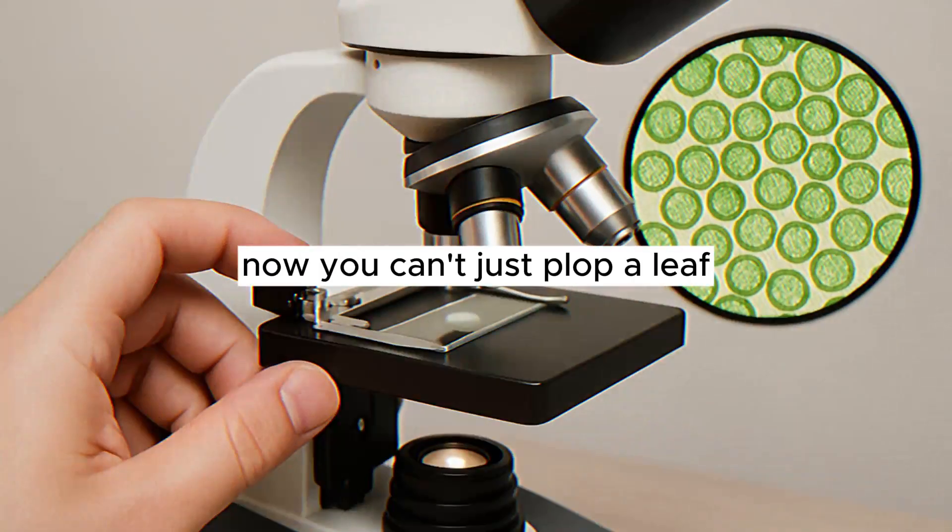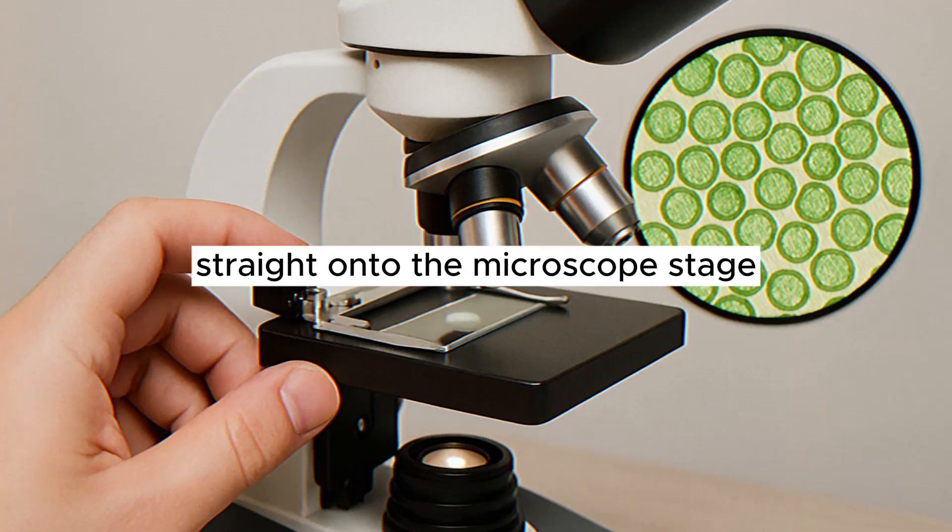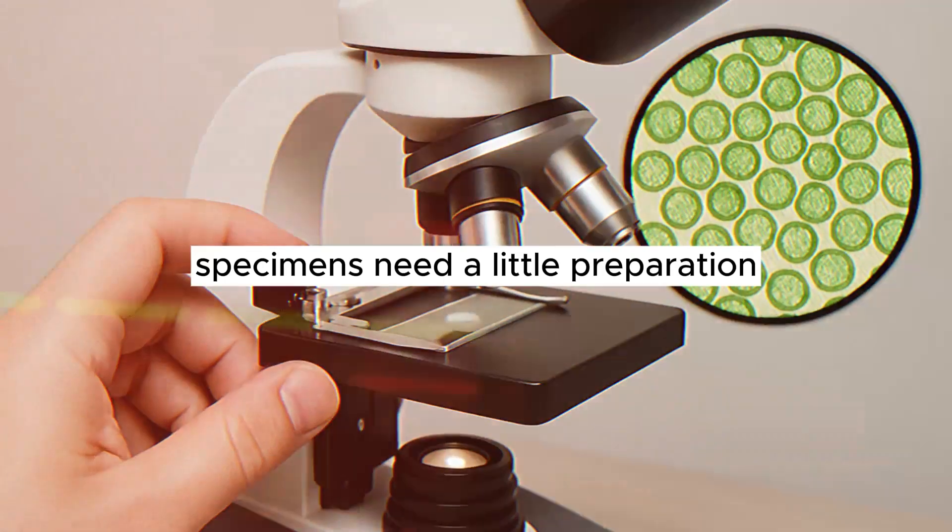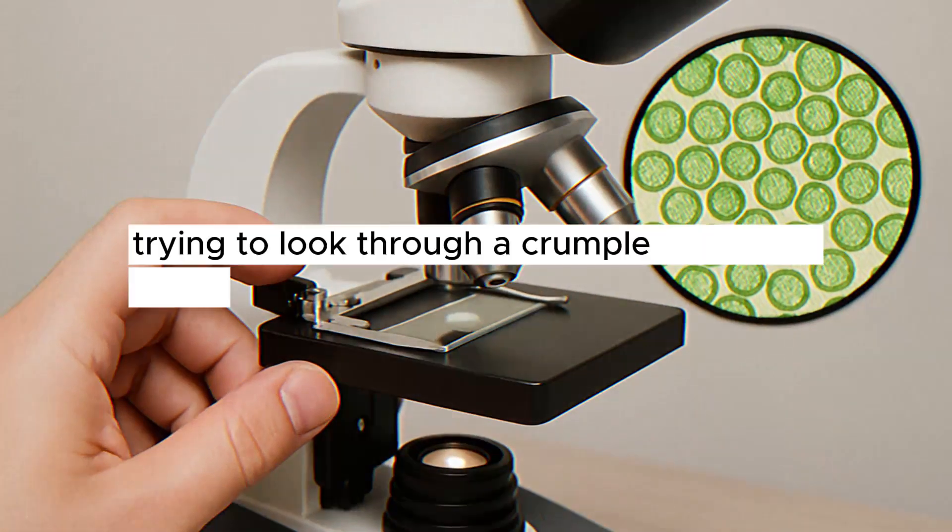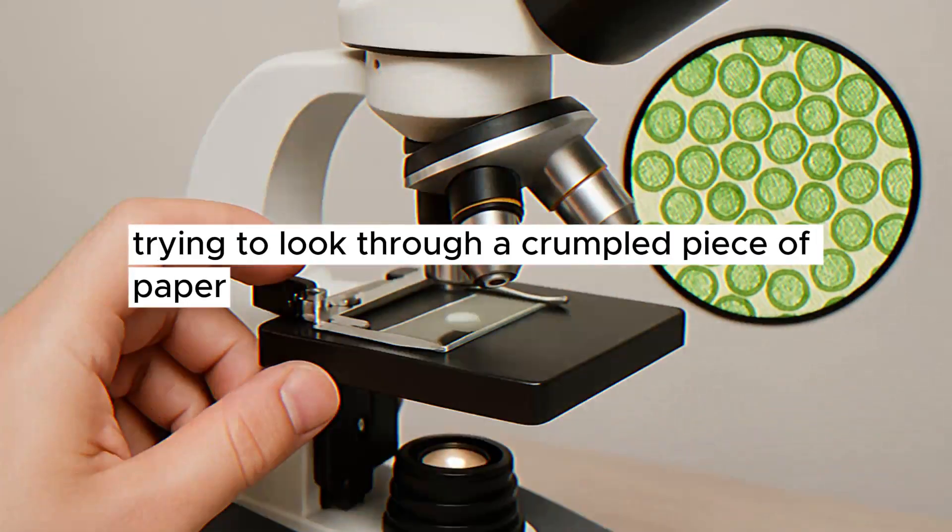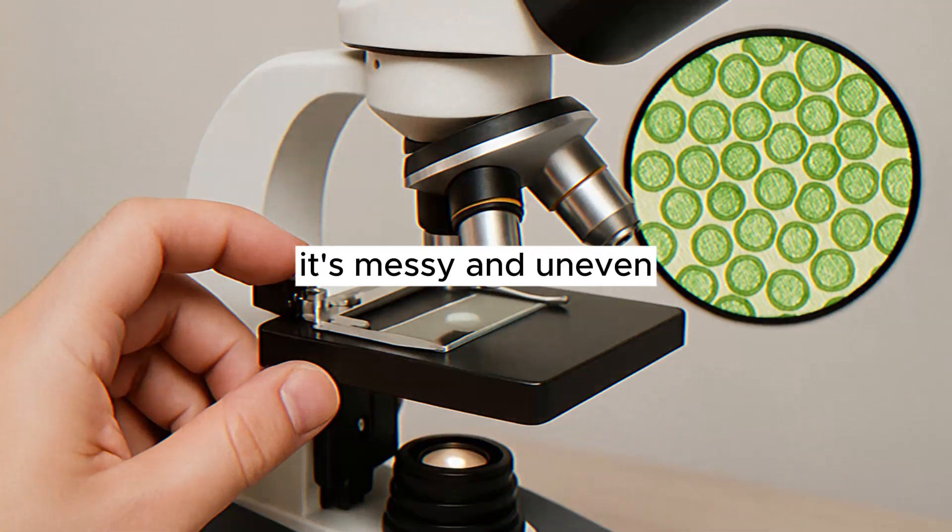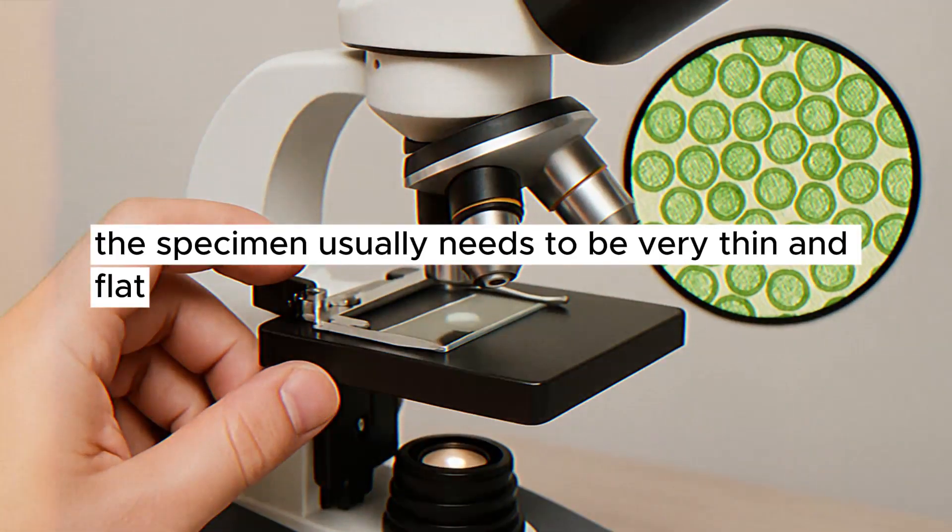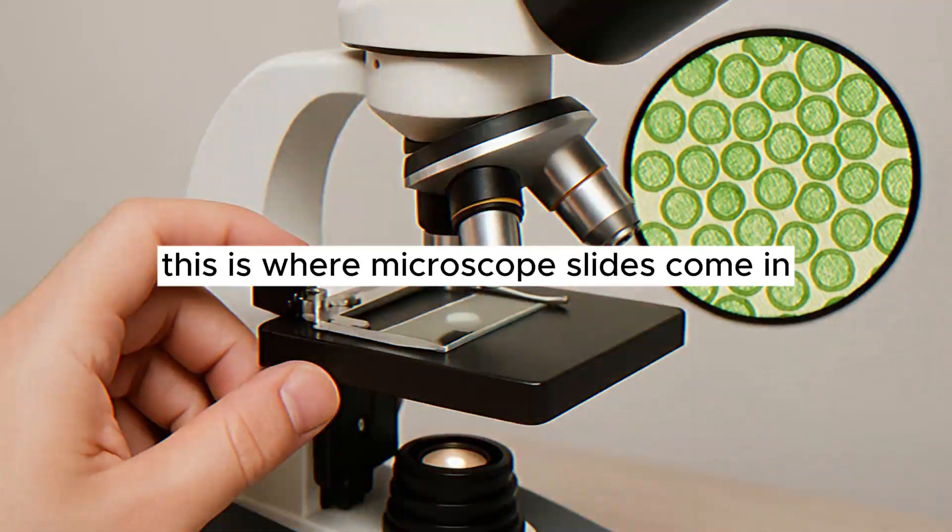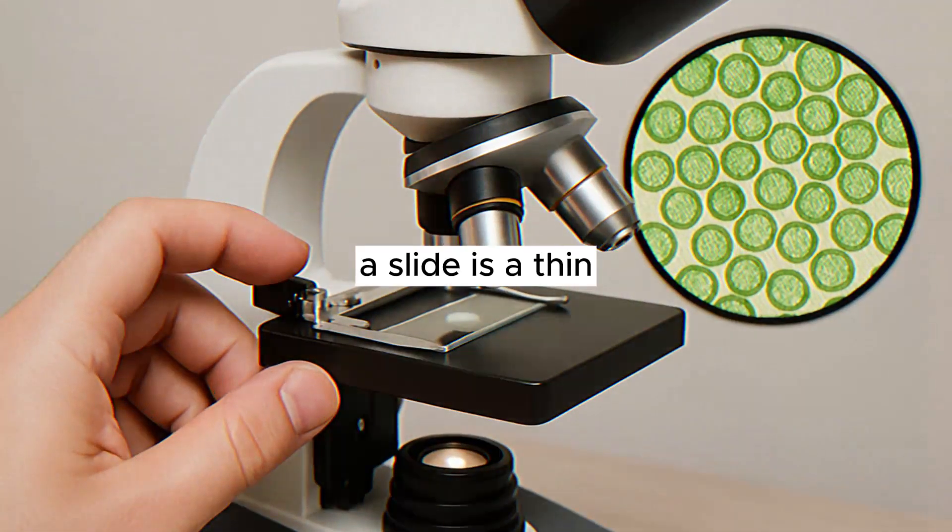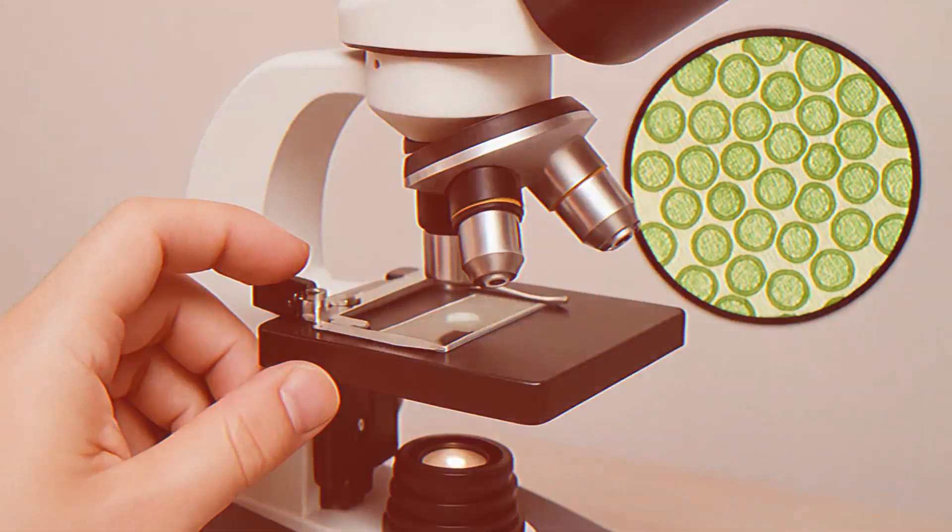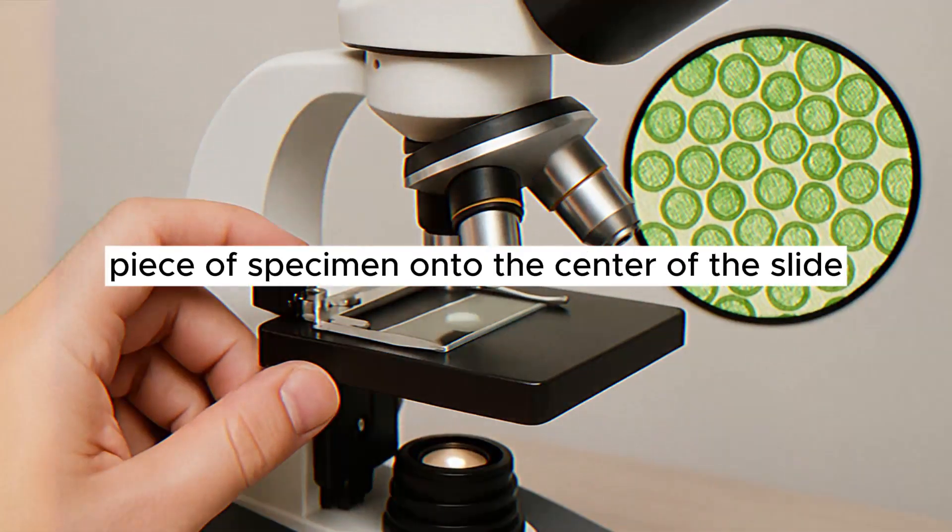Now, you can't just plop a leaf or a piece of your skin straight onto the microscope stage and expect to see cells clearly. Specimens need a little preparation. Imagine trying to look through a crumpled piece of paper. It's messy and uneven. For the light to pass through evenly and for the microscope to focus properly, the specimen usually needs to be very thin and flat. This is where microscope slides come in. A slide is a thin, flat rectangle of clear glass or plastic.